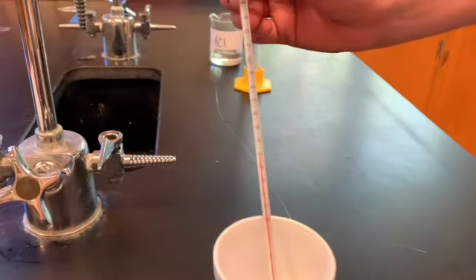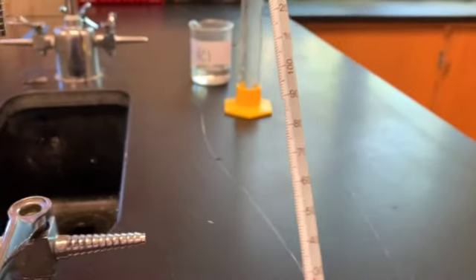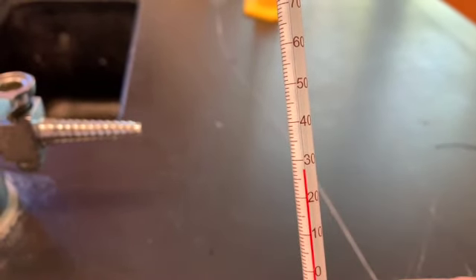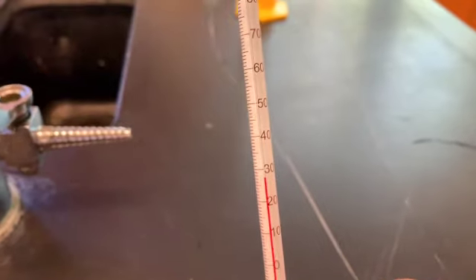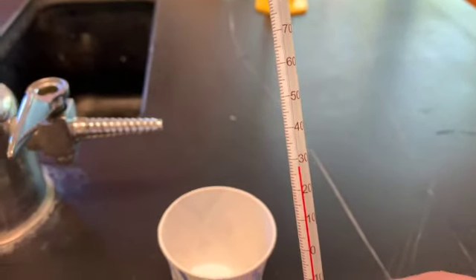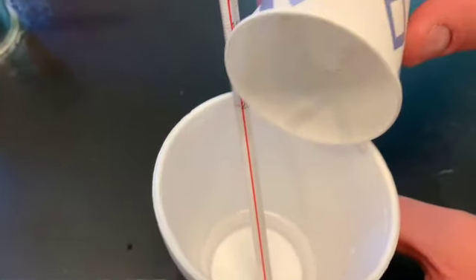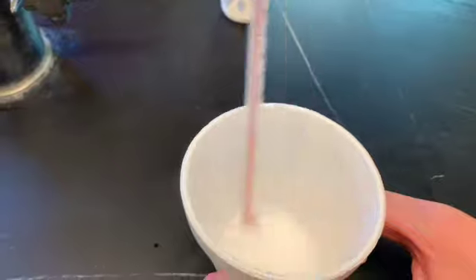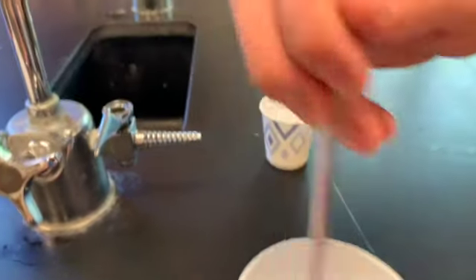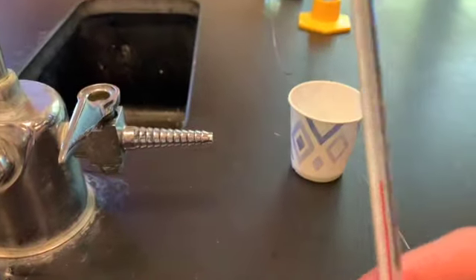Let's get you in focus. There we go. Okay. All right, so there's our initial temperature of our hydrochloric acid. Maurice is going to add the 1 gram of magnesium oxide into the hydrochloric acid. And he's going to give it a little stir. We can already see some reaction happening. Great. And just as before, we're going to see the highest temperature reached.